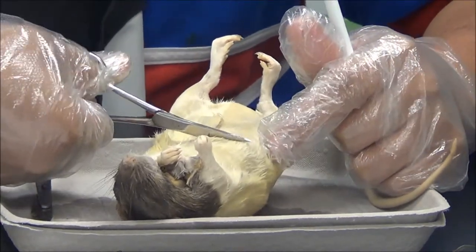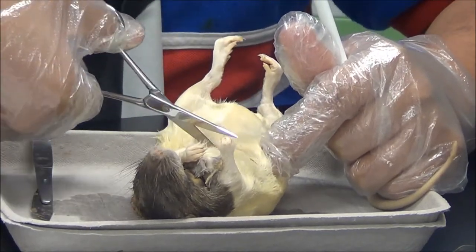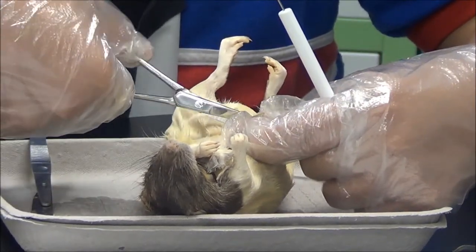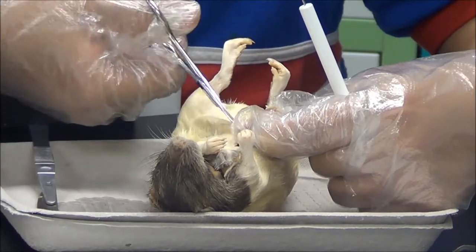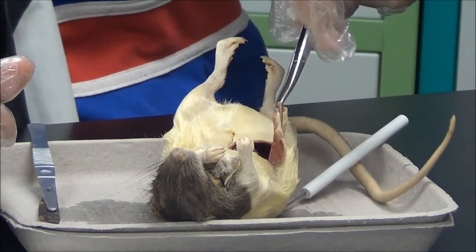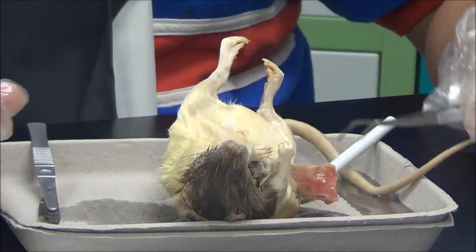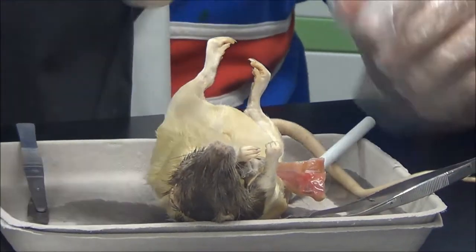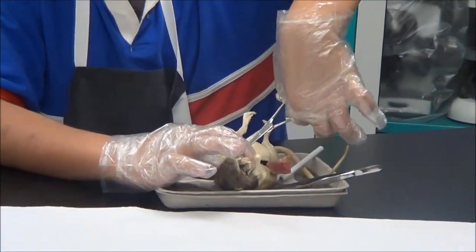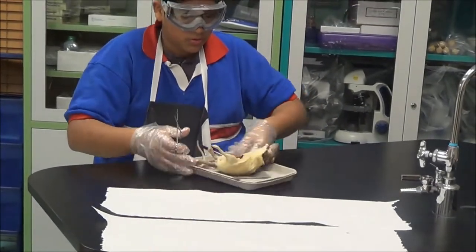I will be cutting from the stomach about halfway towards the back on both sides. Then I will grab my tweezers, remove the flaps, let the fluid drain out, and I will repeat the process on the other side. Flip the tray over — it makes it so much easier.